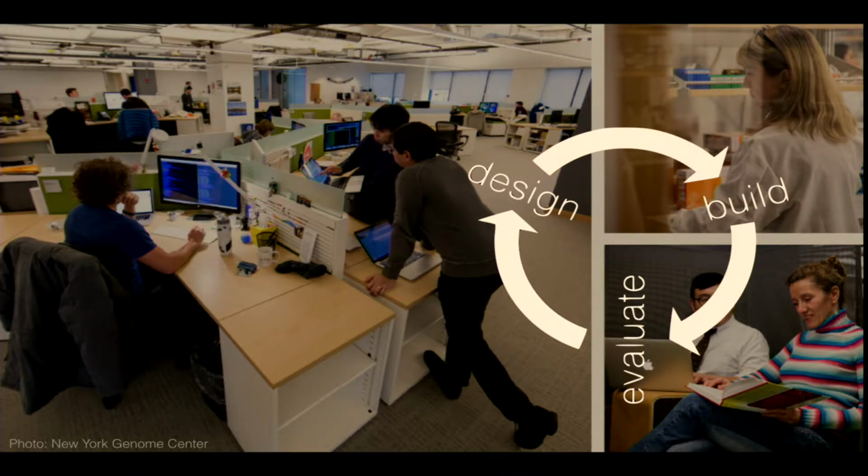And so the job for our tool was basically to take that mess of data that has very little meaningful information in the individual data bytes, and turn it into something that a biologist can look at and make sense of without having a whole staff of computational people on their side to help them.